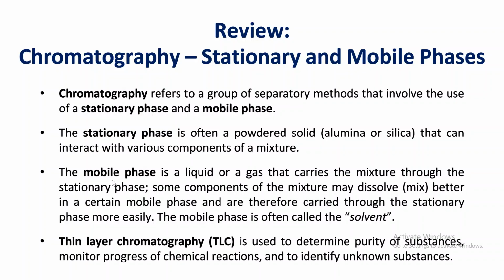And the mobile phase is the liquid or gas, but in our experiments, it's usually a liquid that carries the mixtures through the stationary phase. Now, some components of the mixture could dissolve better in a certain mobile phase and are therefore carried through the stationary phase more easily. So the mobile phase is often the solvent. It's called the solvent.